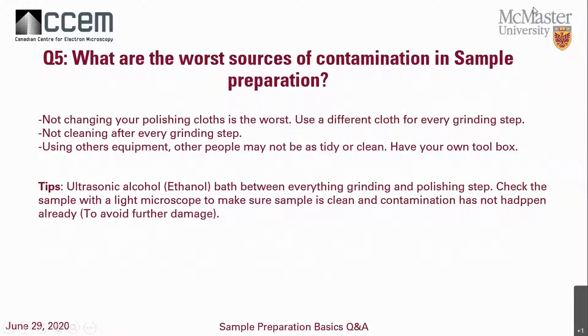Question five: what are the worst sources of contamination in sample preparation? Most issues with sample preparation tend to be contamination, so understanding where it comes from helps eliminate it. The first main source is not changing polishing cloths. For example, if I have a 6-micron cloth for zirconium and one for steel, I don't want to mix them — zirconium contaminants will definitely scratch your steel surface. Separate your cloths according to material.